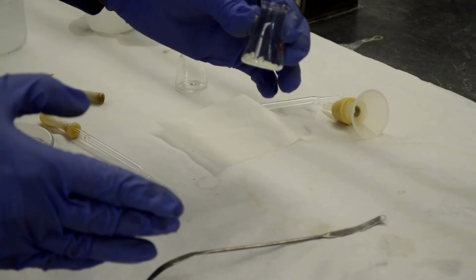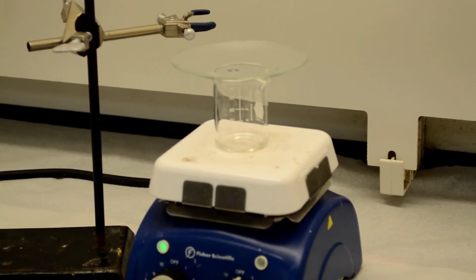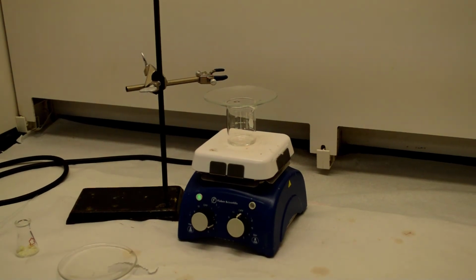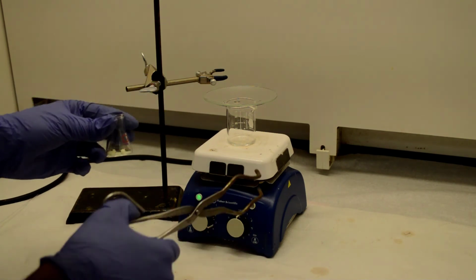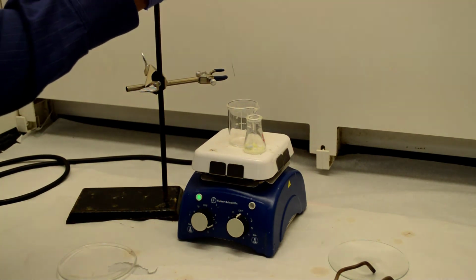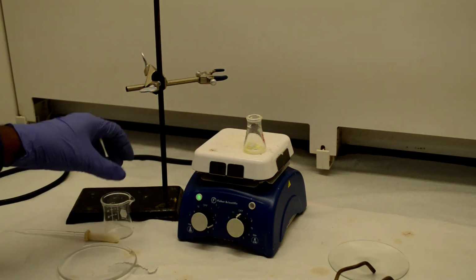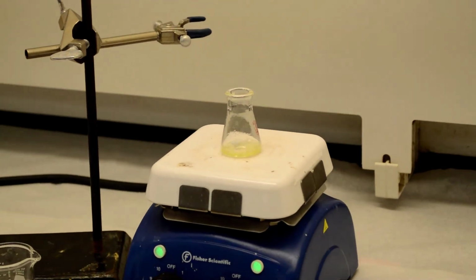So let's go ahead and add boiling methanol, a solvent at a higher temperature. We're going to add the boiling methanol into your crude product. So let's place the crude product here. I just added a little bit of boiling methanol that dissolved all of our product and impurities.